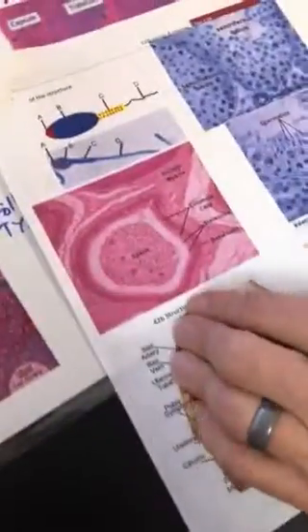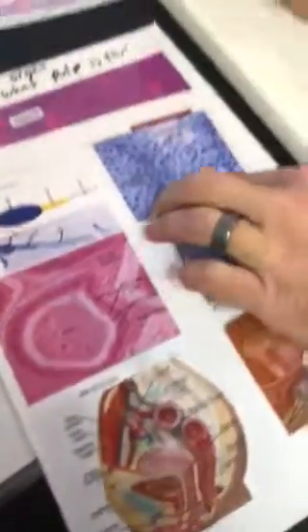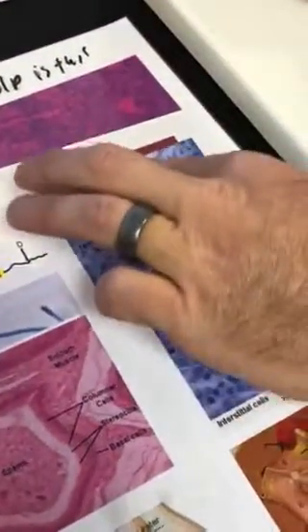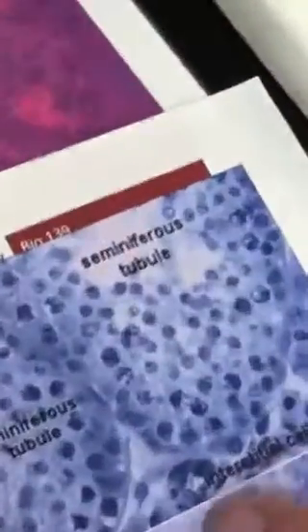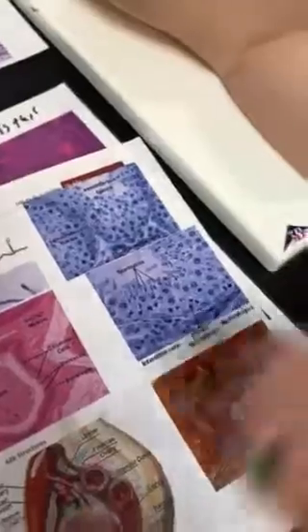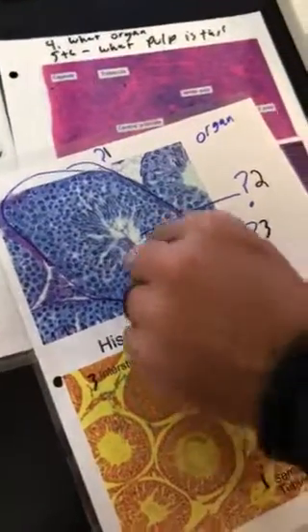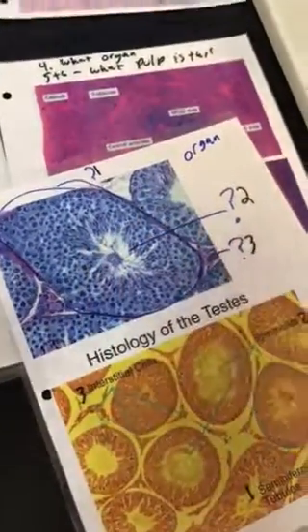This is an epididymis because it has all these sperm in the center here. Okay. This is a seminiferous tubule because it has a space in the center. And then these are interstitial cells in between. So these are interstitial cells. I mean, these are the seminiferous tubules. These are interstitial cells. These are little spermatids in the center.